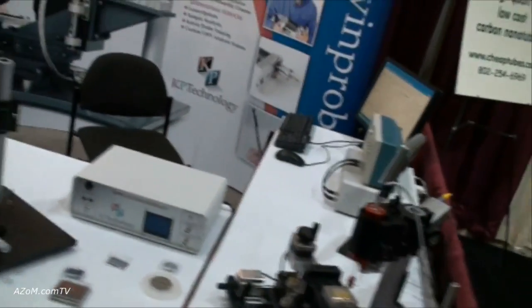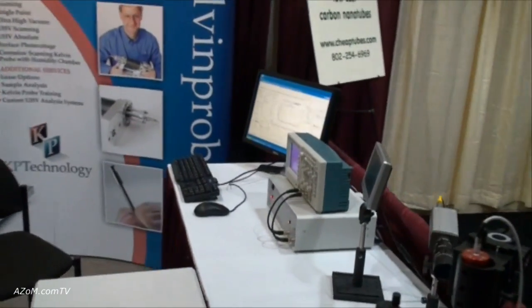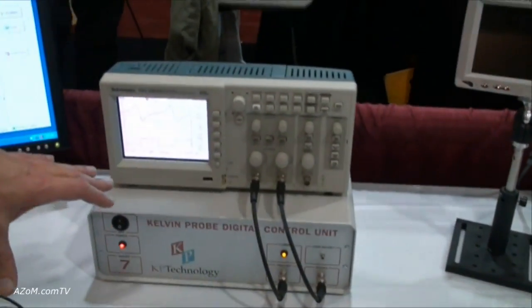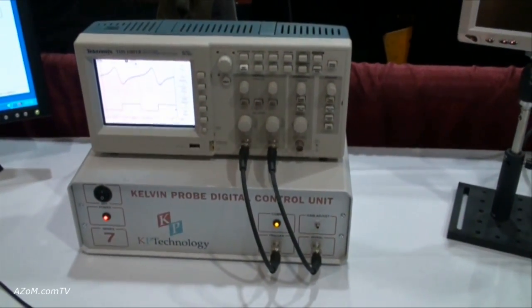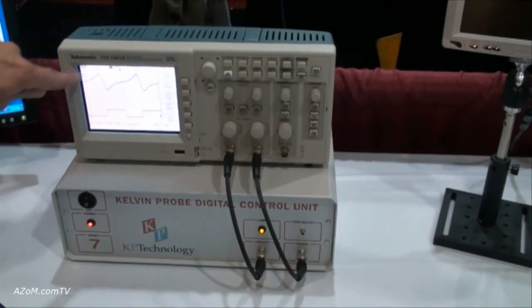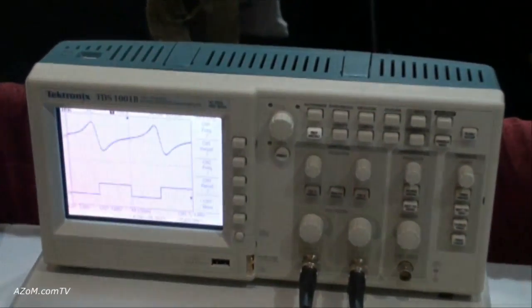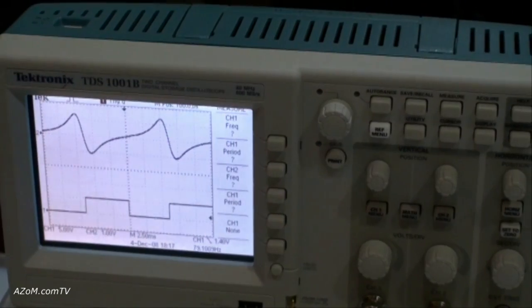This is a control unit. It's digital, drives the probe, and sets the frequency of the probe, the amplitude of oscillation, and the spacing. This is the Kelvin probe signal. This is the closest approach as the tip comes close to the sample, and this is the point where you go farther away.